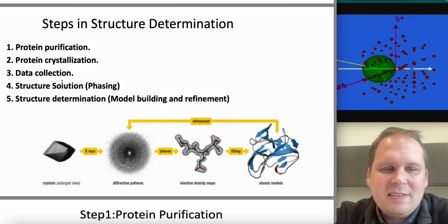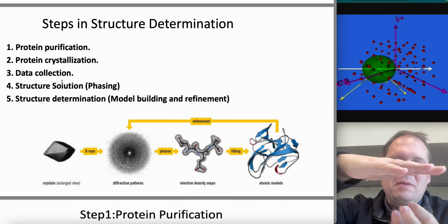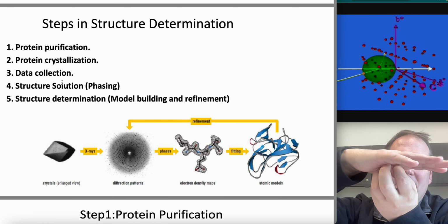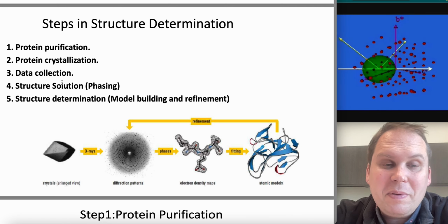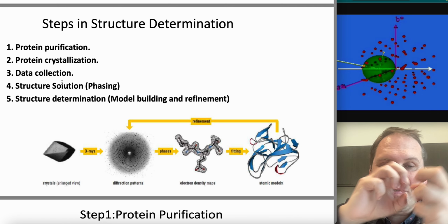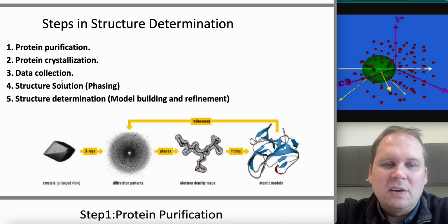One of the common methods still used is the hanging drop method, where you put a very protein-rich drop on the underside of a slide, and you just let it hang there and slowly evaporate, hoping that as the water goes out, the proteins come together and make that little crystalline organization.